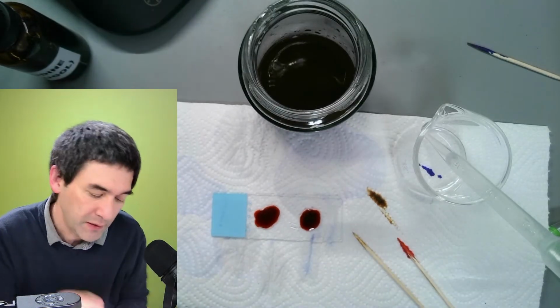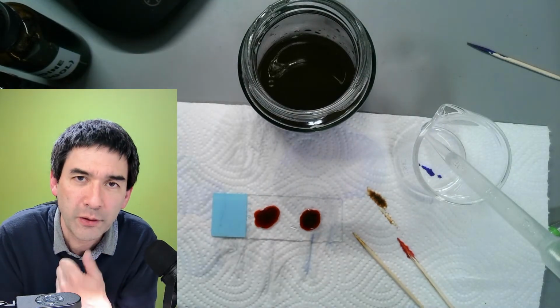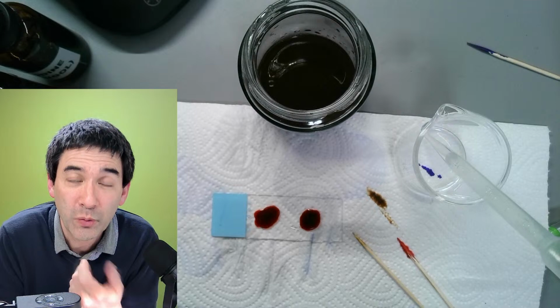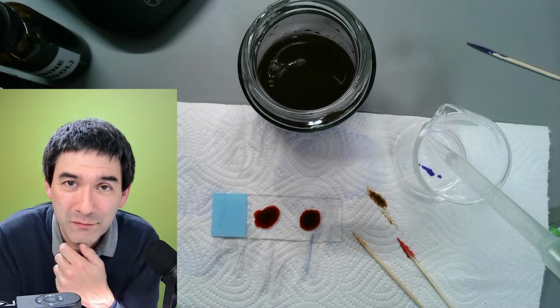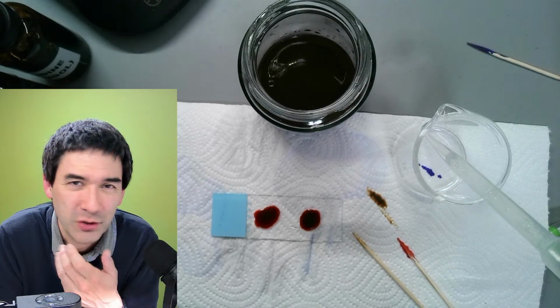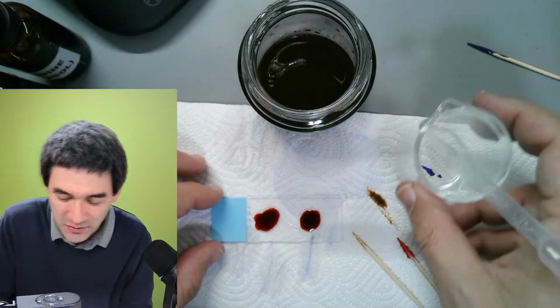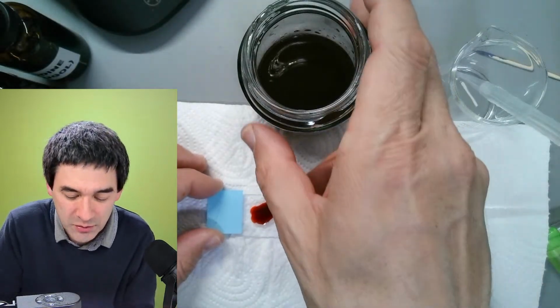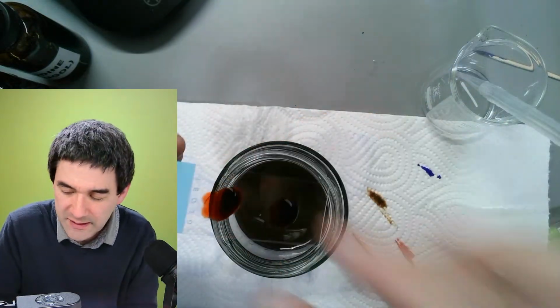I'll give you an example. It's used for quality checks. If you are working in microbiology and you're supposed to work with E. coli all the time, and then all of a sudden you've got a Gram positive bacterium on your petri dish, you know that you're working with a contaminant. So that's the possibility to do some quality checks. I think that's enough now, and let's have a look here.